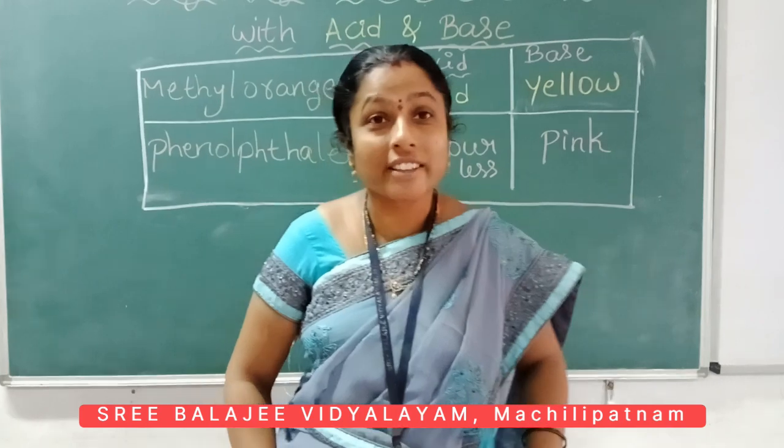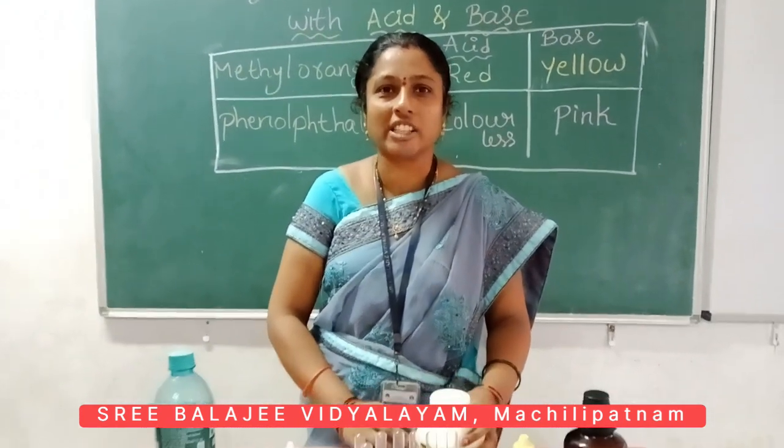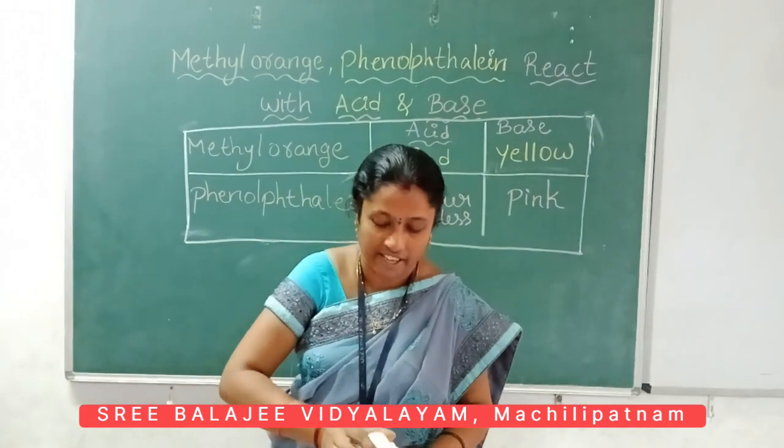Children, today I will show one experiment for you. What is that experiment? Acid and base react with the methyl orange and phenolphthalein indicators. And which type of colors are we going to observe once we start the experiment?